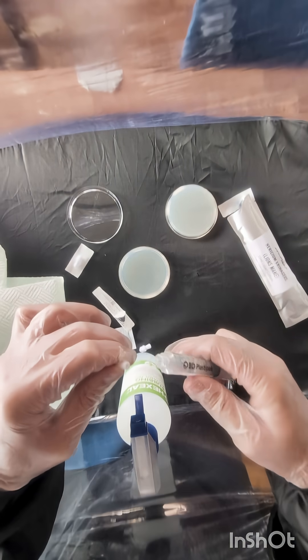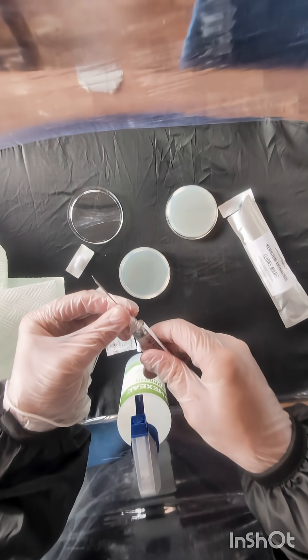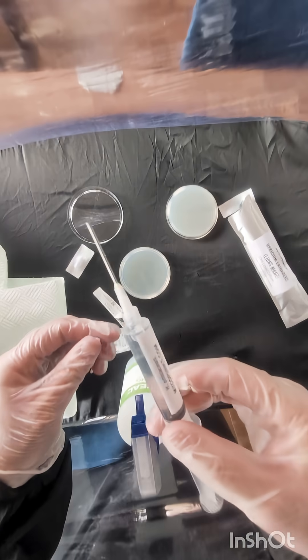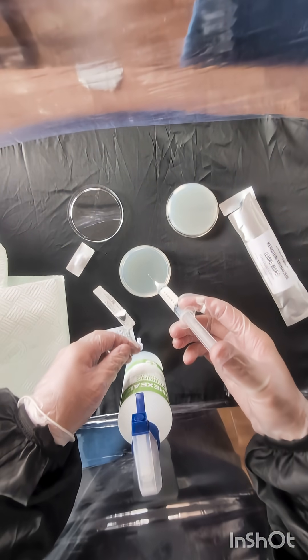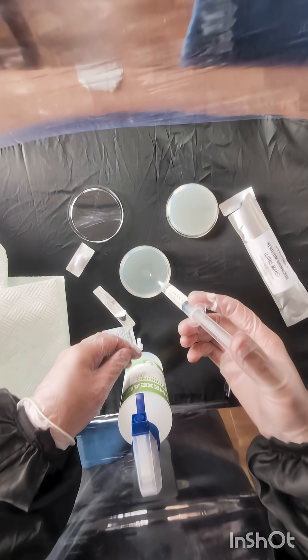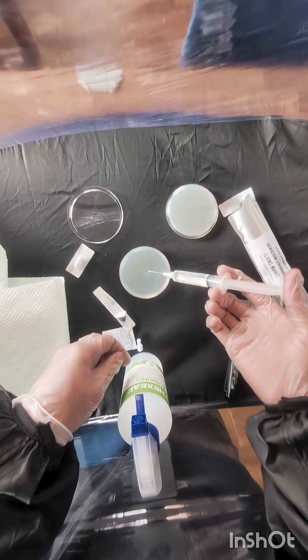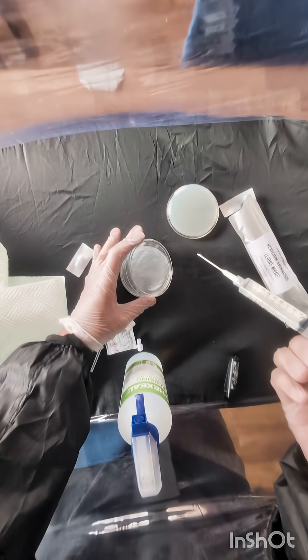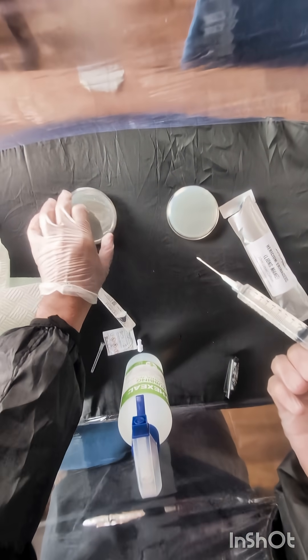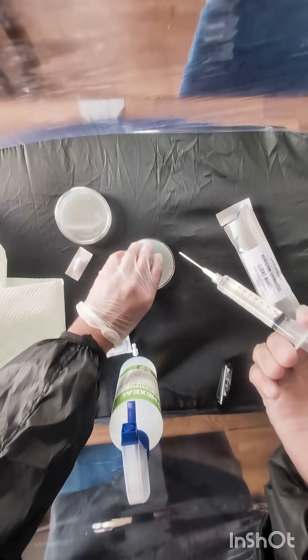Now this next bit is really going to confuse you — what you need to do is get your syringe and put your needle on it. Doesn't matter if it's a liquid culture or a spore culture, make sure you give it a good shake and mix it all up. Then simply drop a couple of droplets onto your agar plate, and that is it — that is how you take a culture from your syringe and let it grow out to see if it's good or not.